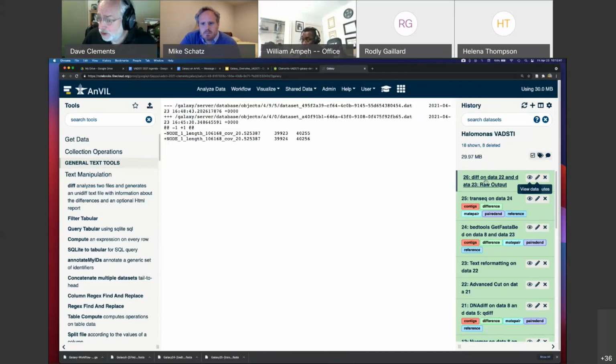But you can install tools on Galaxy by doing the admin and then go to the tool shed. Okay. So that, I think, is my last thing before I shut this down. Have we got any questions before we show you how to shut this down? Because once we shut it down, I can't show you anything.